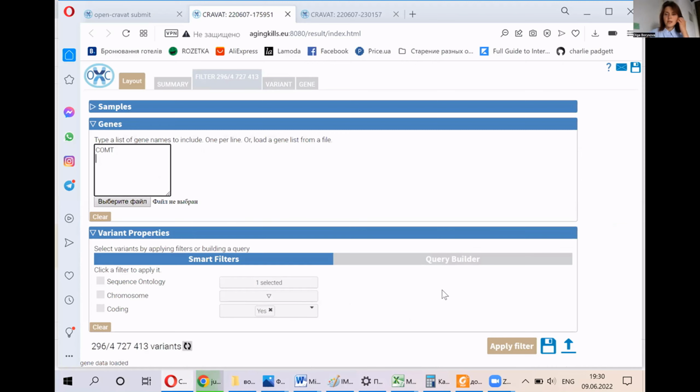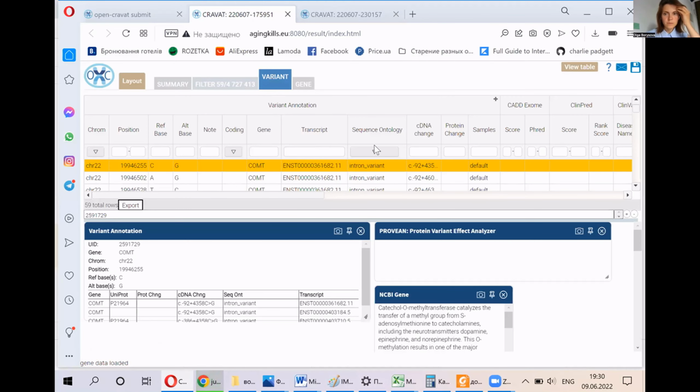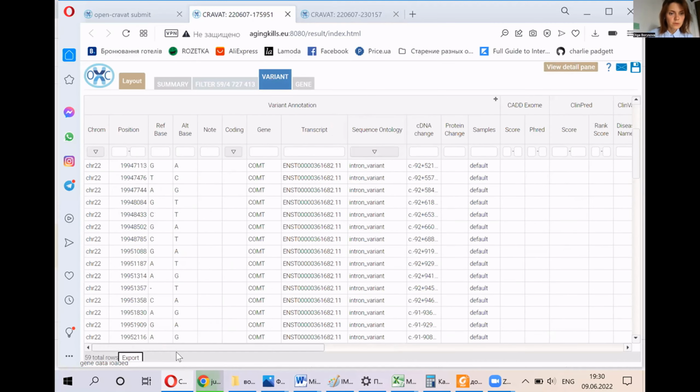And according to that, you can make predictions on your stress response, because people with one genetic variant, which has, okay. Quite a plenty of substitutions.